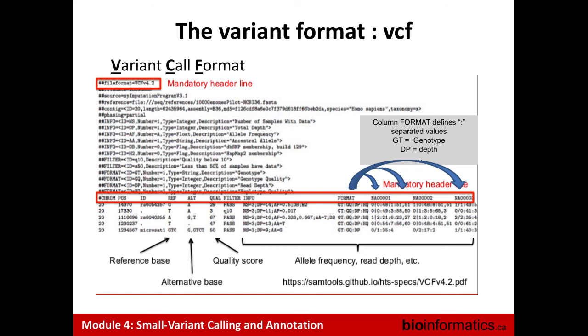But does these low-quality samples have an effect on the other 90, or not really because they have a low weight? No, they will have a low weight, and at the moment it's not different. It will not bring information that will mislead the others, because it will be the same experiment, the same kit, everything. It's just that it cannot bring the full potential of information. So for the variant calling, it won't affect it.